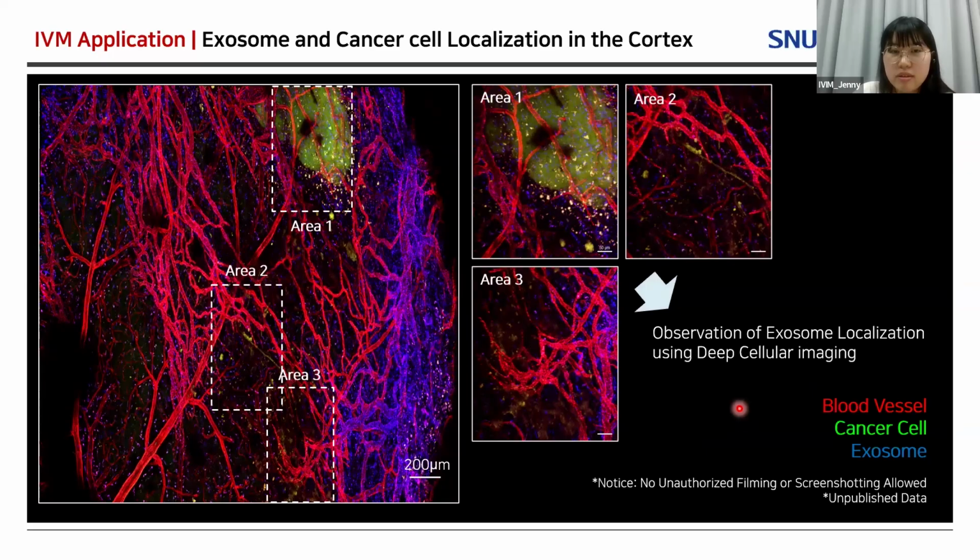Overall, the experiments that I've presented so far in my presentation demonstrate that intravital microscopy allows us to effectively observe the distribution, movement, and dynamic behavior of exosomes in vivo, underscoring its utility as a highly valuable method for studying targeted delivery and cellular interactions.